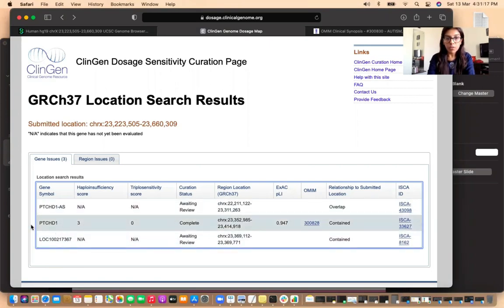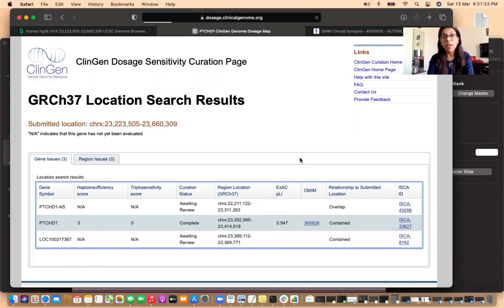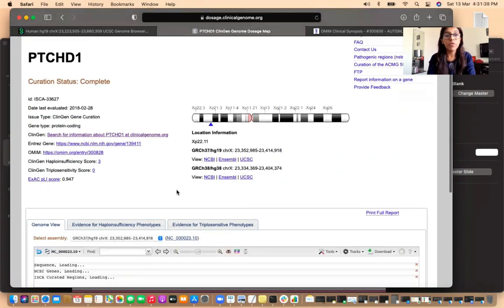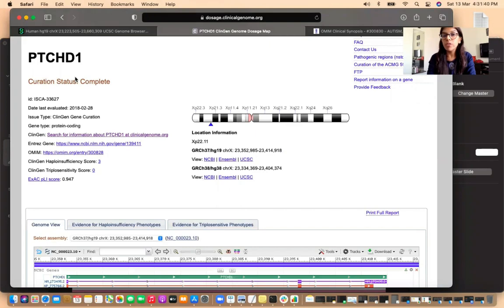Now that we know there is one protein coding gene with a curation status of complete by the ClinGen dosage sensitivity group, we go to its further details by clicking the ISCA ID hyperlink. We are directed to a page with detailed information about the gene PTCHD1, showing curation status as complete and last evaluated in 2018.